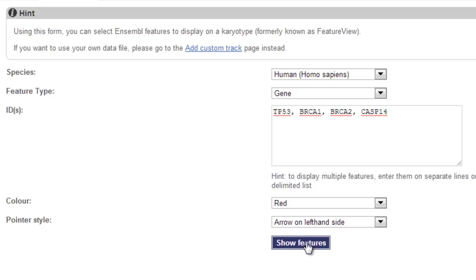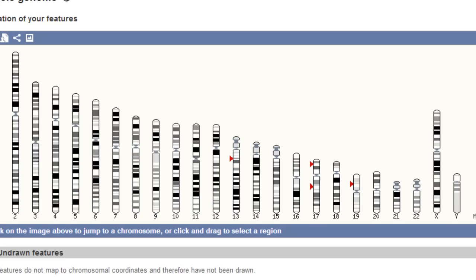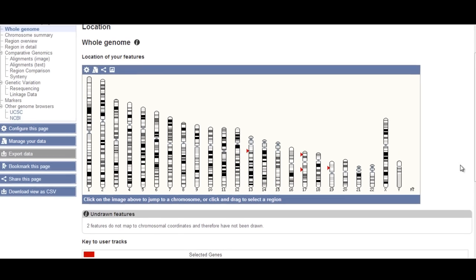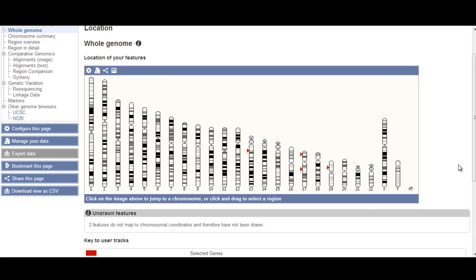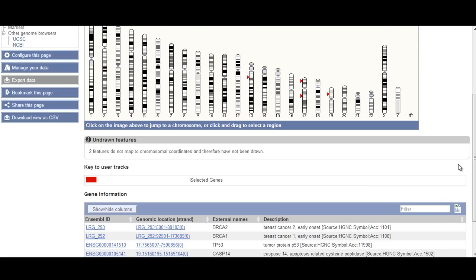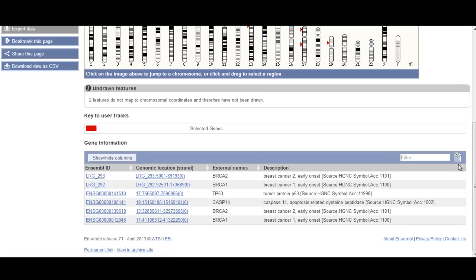Now I will click Show Features. My four genes are shown along the karyotype as red arrows, and if I scroll down I can see a list of where they map to.